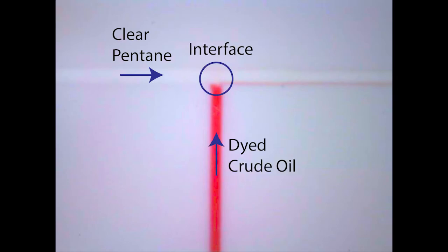Shown here is a magnified view of our microfluidic chip. We flow clear pentane in from the left hand side while red dyed oil enters from the bottom, forming an interface at the intersection of the two channels.